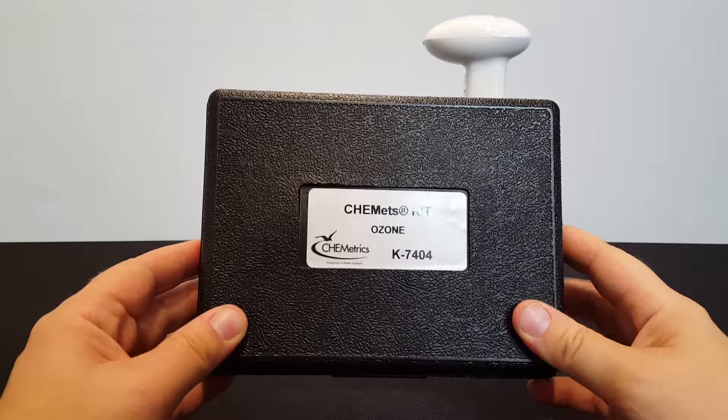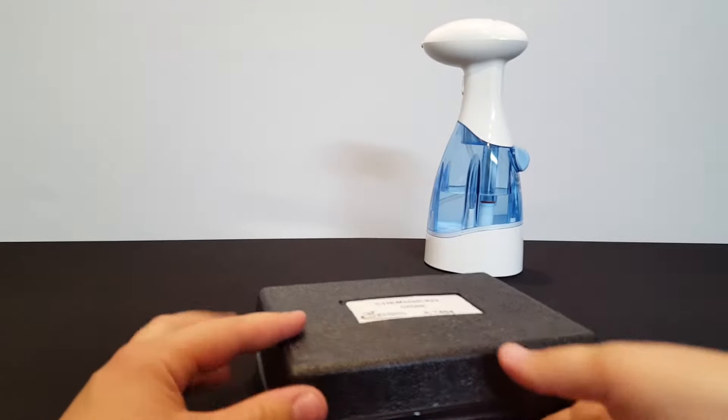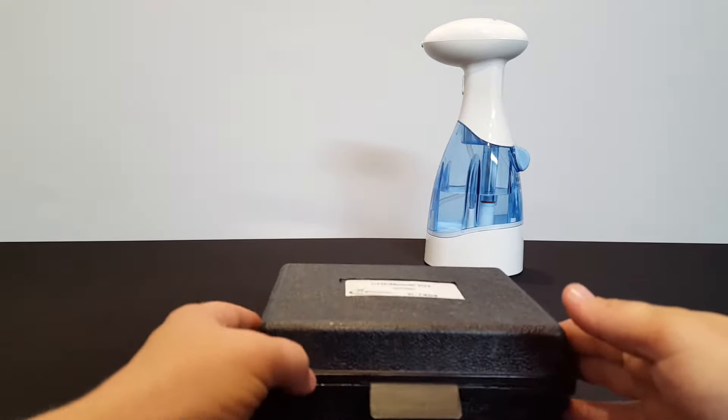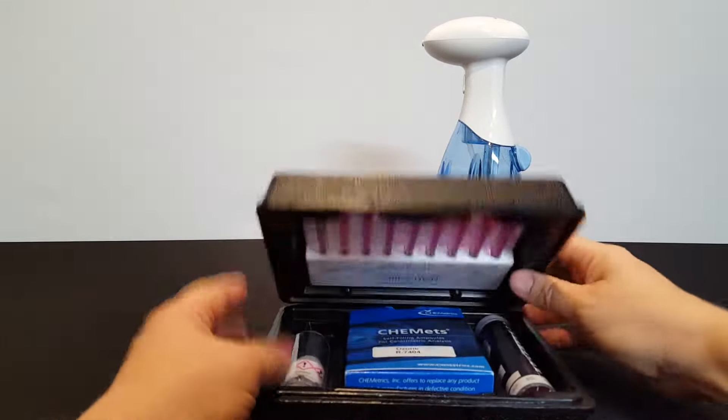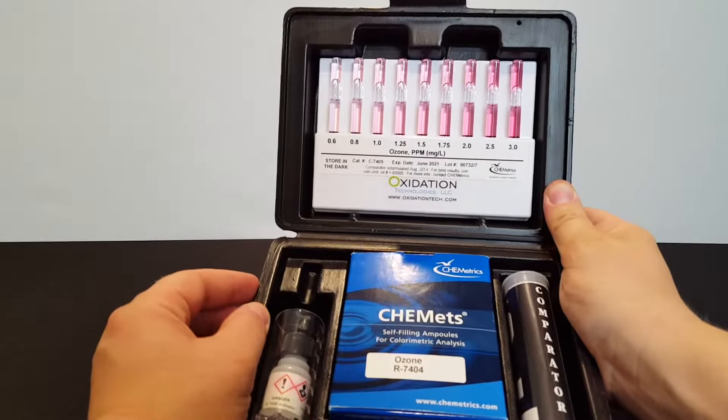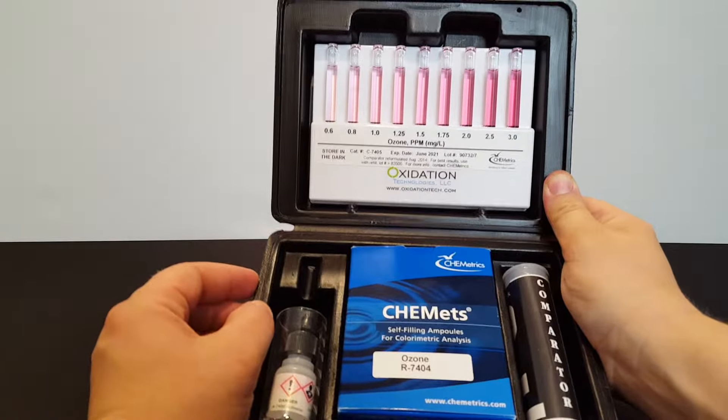This is the K7404 Dissolved Ozone Test Kit. When you open the kit, you can see that there's multiple items included with it.